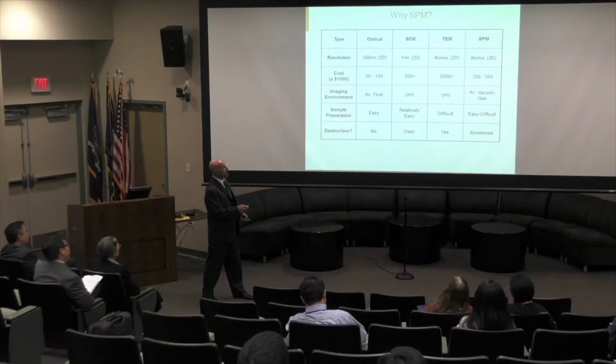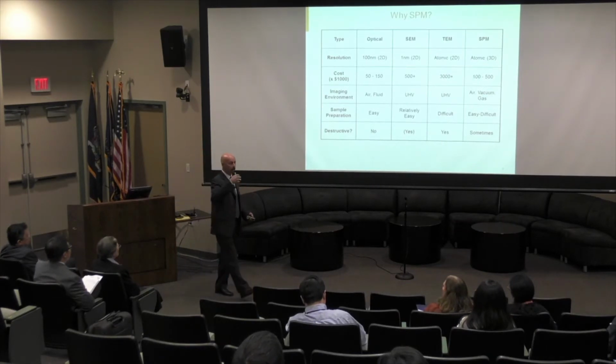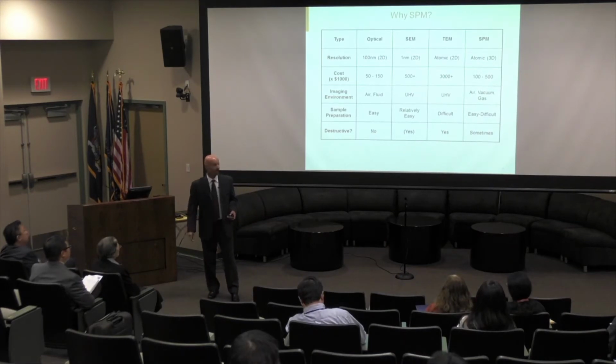But that being said, the SPM and its associated techniques have lent themselves very well, with their ability to resolve features at a very small scale and look at different properties of materials, material properties, electrical properties, and there's a whole plethora of different types of techniques that have evolved, right from that first scanning tunneling microscope or the first AFM that they constructed at Stanford. So there are a lot of advantages to using scanning probe microscopy for state-of-the-art semiconductor device analysis.